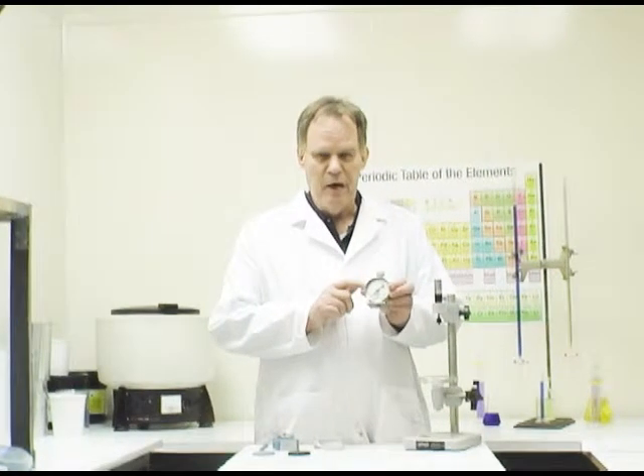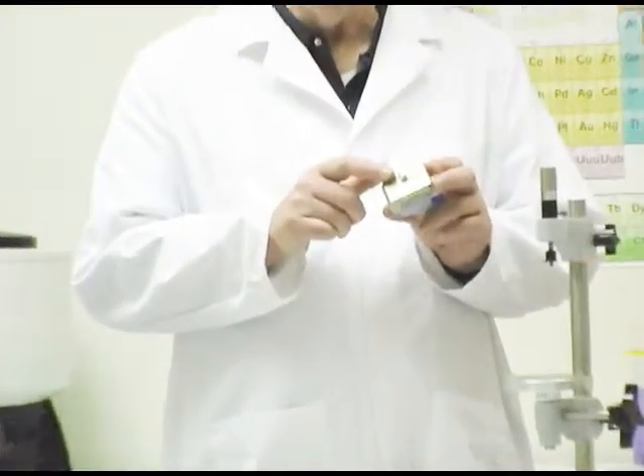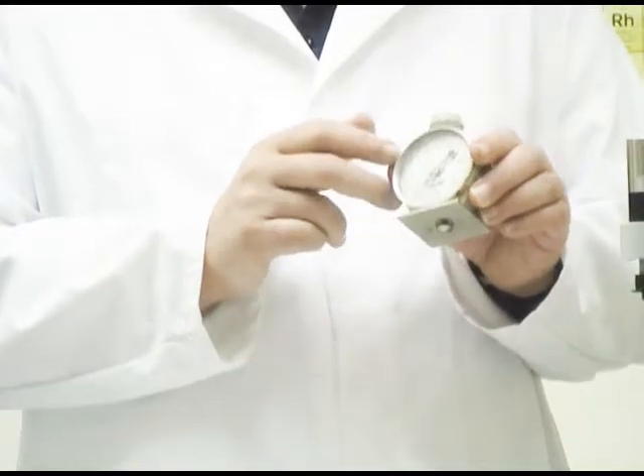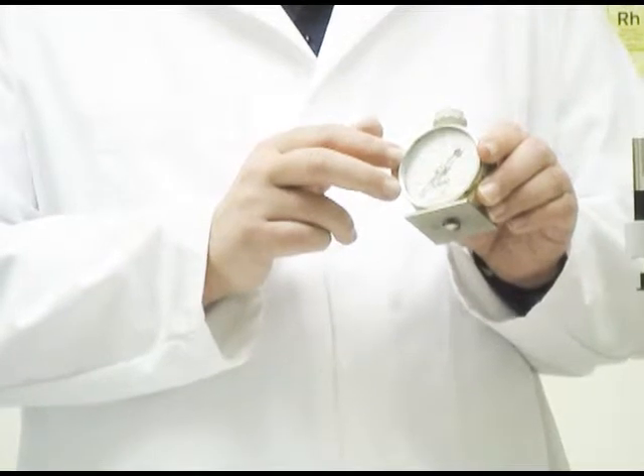We'll talk about the basic features of a durometer first, and then I'll show you a few different types of durometers. A durometer consists of a body. Inside the body is a carefully calibrated spring that measures the extension or impression forces necessary to move the indenter. The indenter is located at the bottom of the durometer right next to the base plate.